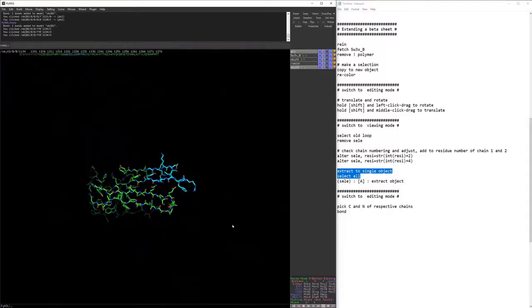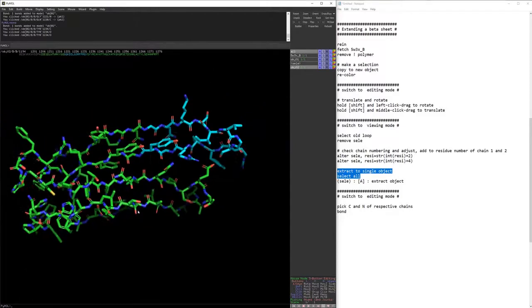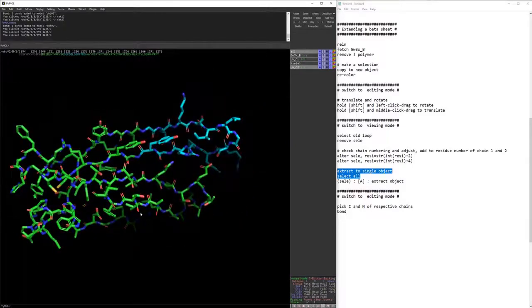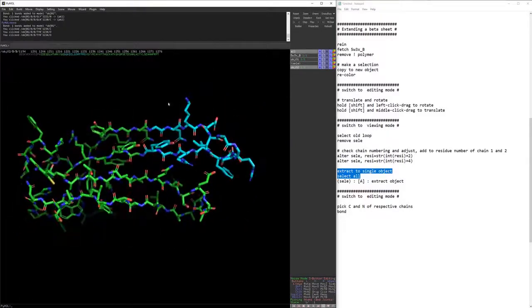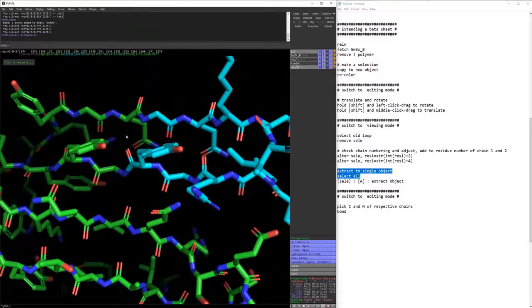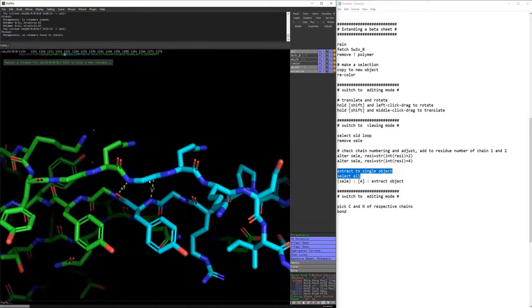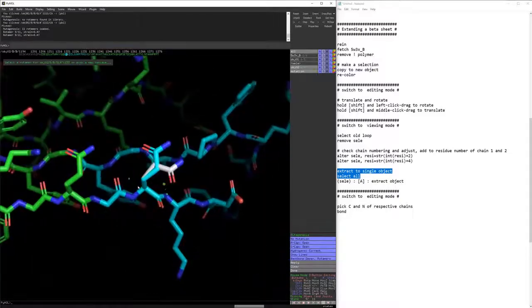And then again, you can save this molecule and put it through some minimization of some method or another in order to accommodate that. And of course, once you've made that extension, if you need to repair the actual amino acid sequence, we can go into the wizard here, go into the mutagenesis tool for proteins, and then you can just sequentially move through those amino acids that we had.